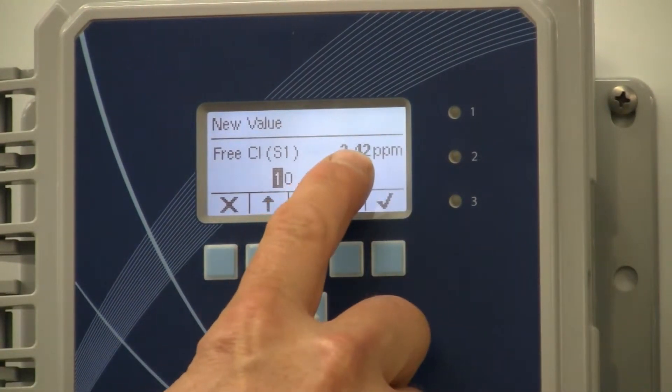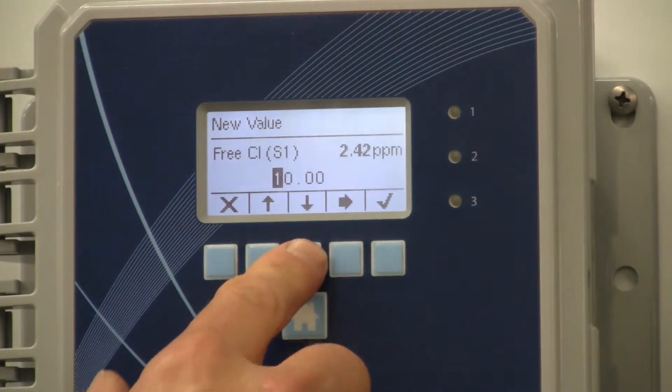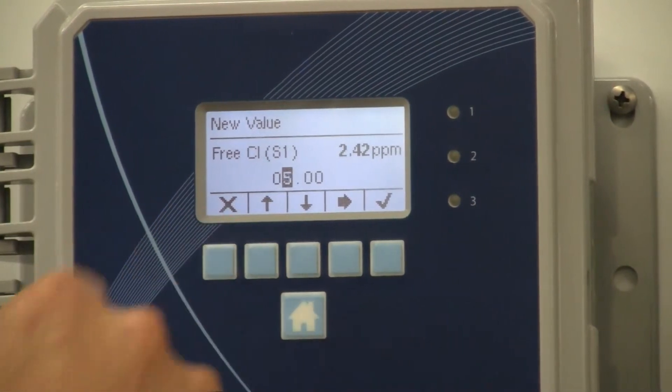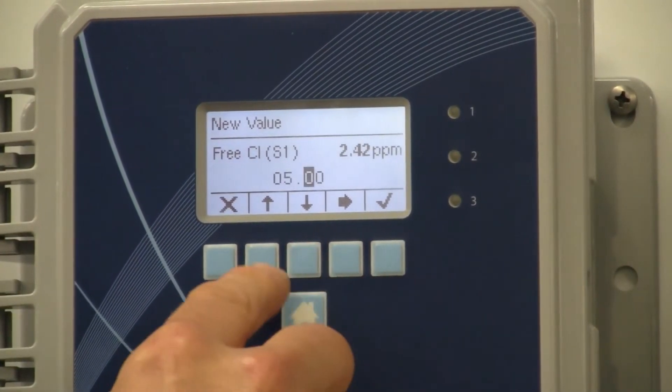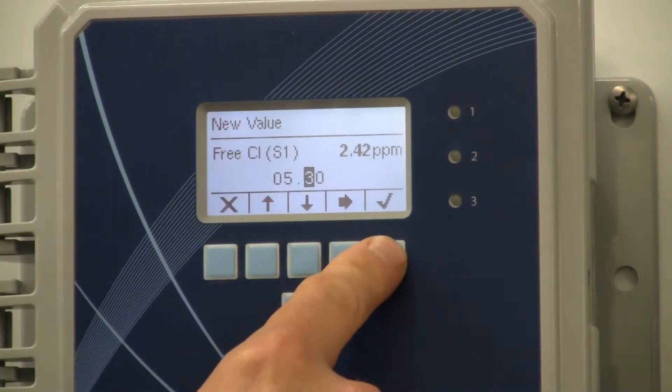The current measurement is 2.42, so I am going to enter 5.3. Down — there is 5 — 5.3 — enter.